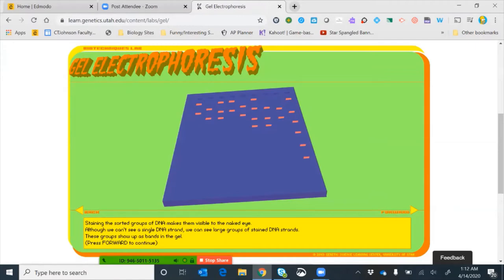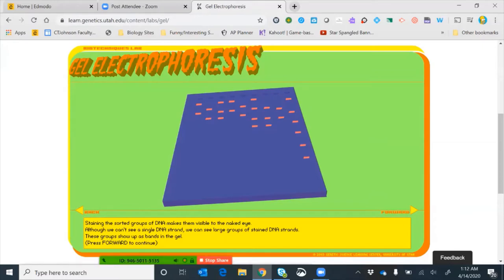We need to stain the gel in order to see the DNA. Staining makes grouped DNA molecules visible to the naked eye — although we can't see a single DNA strand, we can see large groups of stained DNA strands. These groups show up as bands in the gel. Bands further down the gel are smaller pieces; bands near the top are larger. For example, a band near the top might be 10,000 base pairs long, while a band near the bottom might be only 1,000 base pairs.